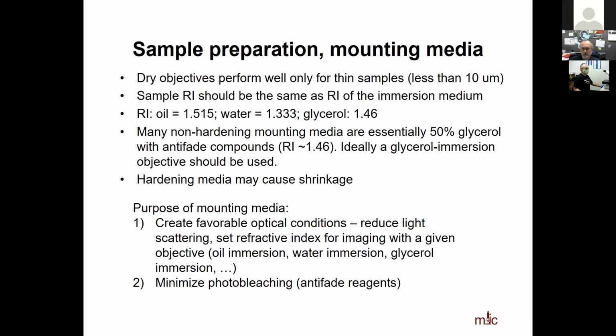For instance, Thermo Fisher sells something called ProLong Glass that has the right refractive index. Citifluor is another company, and there are lots of others, or you can make some of your own.